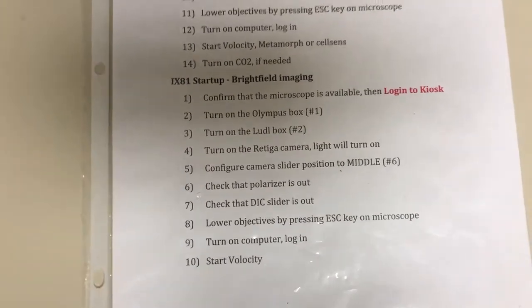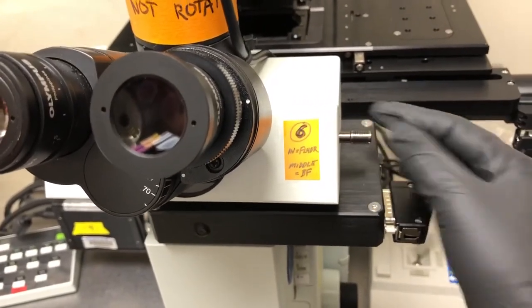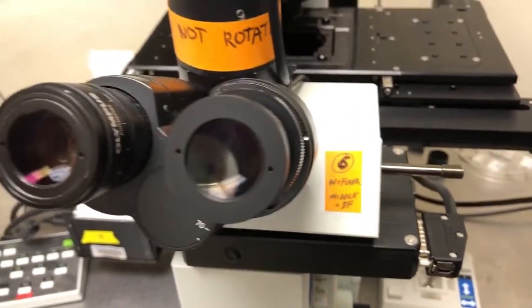We need to configure the camera slider position to the middle. The camera slider has a number six next to it. This is fully in, this is the middle, and this is fully out. We need it in the middle position.